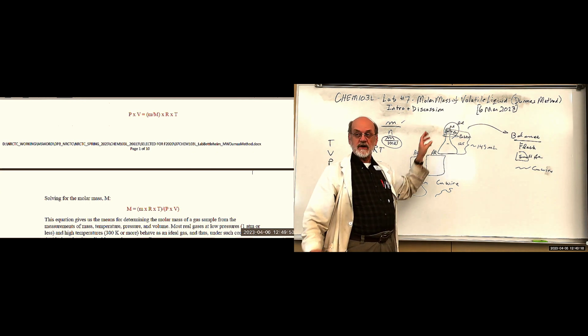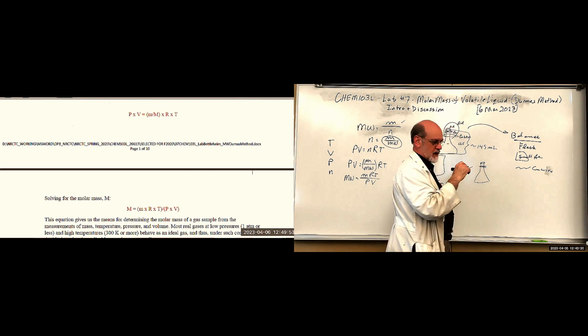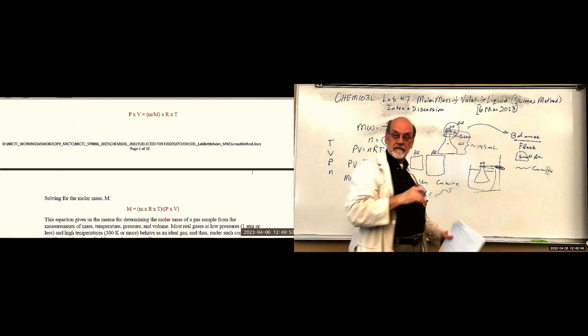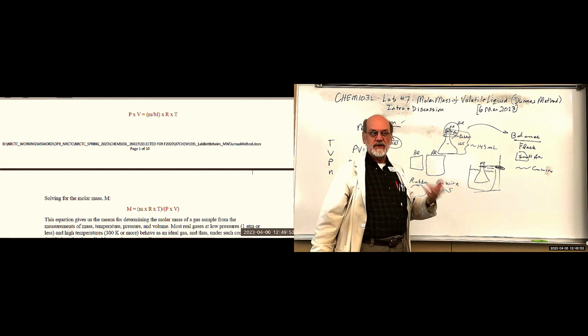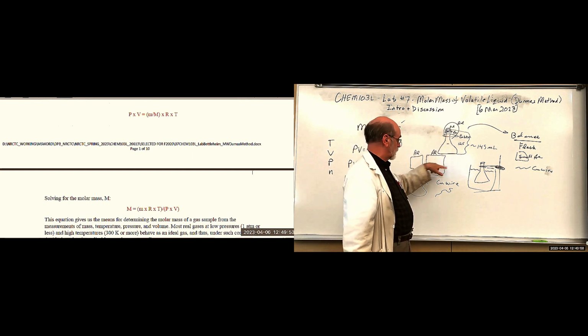It's just there to protect it, because you're going to take this flask and you're going to clamp it. Not yet clamp it, just you're going to clamp it to a ring stand. Okay. So you're going to clamp it to a ring stand and submerge it in your water bath as far as you can get it in there. You want as much of this in the water as possible without getting this part in the water bath. But it's going to be boiling. And vaporizing, you're going to get condensation all over this big one.